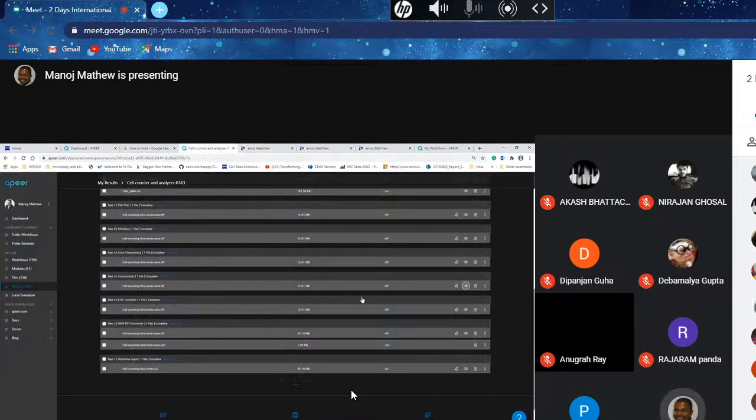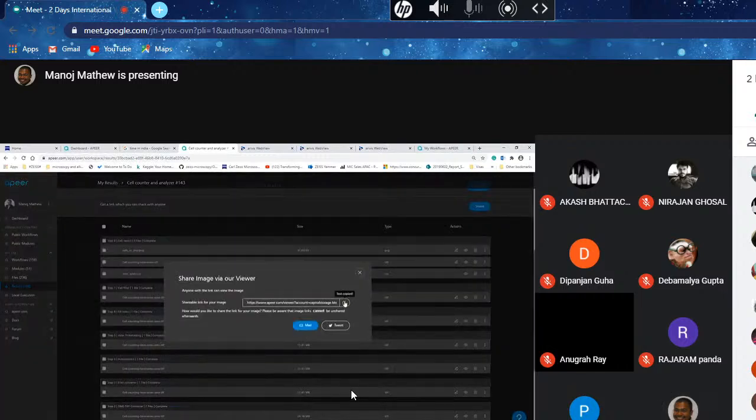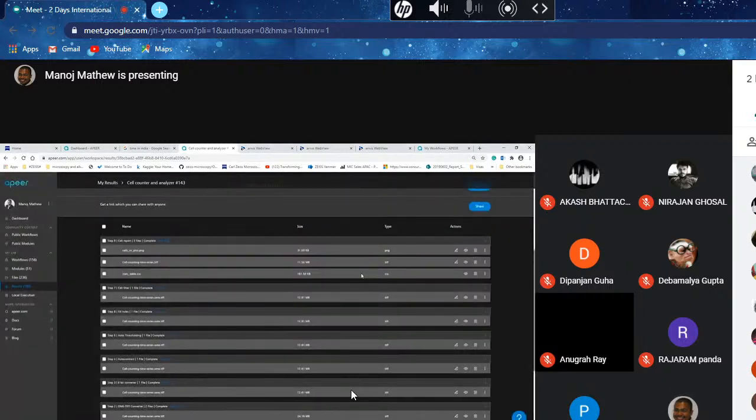And if you want to share this file with someone, I can go and say share. It creates a shareable link. And let me try to post it on the chat here. So maybe you can try clicking on the link and seeing what I just analyzed right now. It makes it very easy and convenient for people to share data with one another. So on the chat, I have posted this link. Please go ahead and try to click it and see if you can see this window.